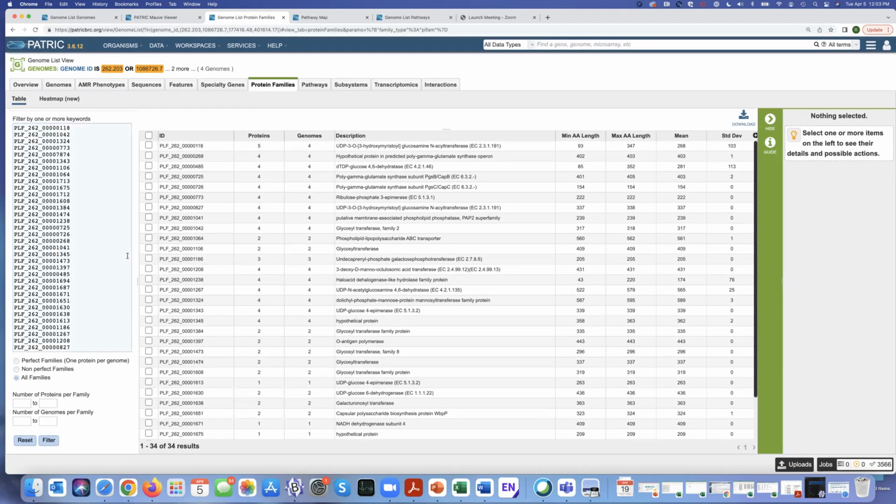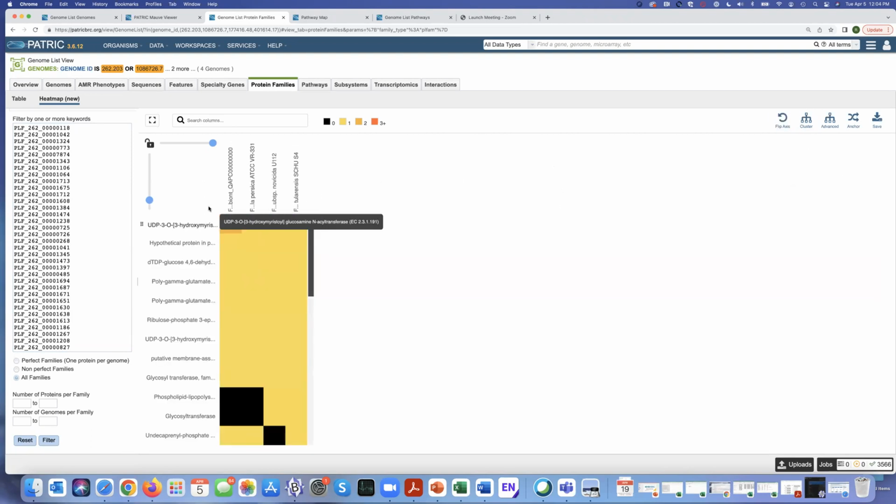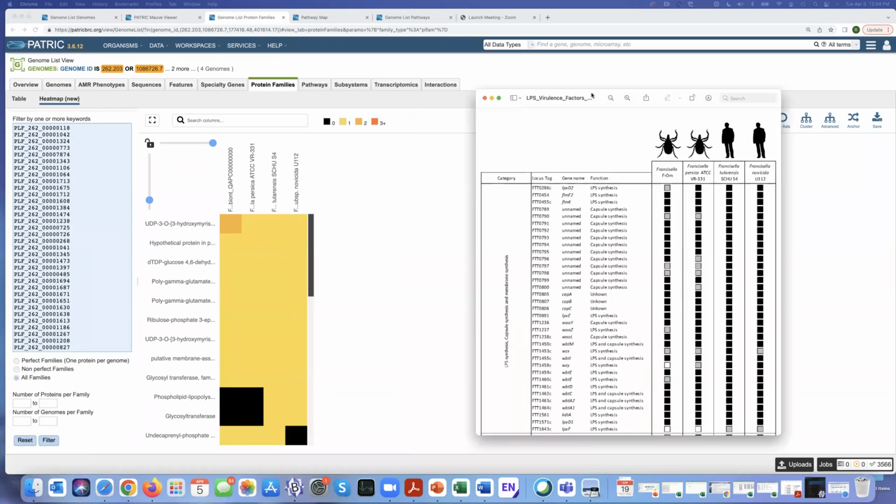I can see a lot of information about that, but I can get a visual view of it by looking at the heat map. So I click on that, and I can even flip the axis and show this was the order that it was in the diagram. Then I could even order these so that you can see they're a little different.